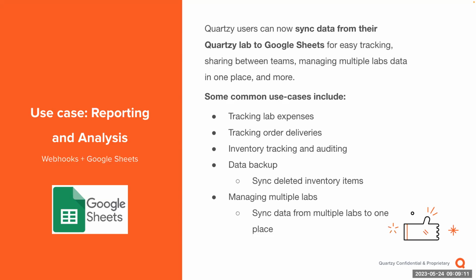So you can sync inventory items as they're deleted. So you always have that nice data backup. That way you can restore those items if needed. And then managing multiple labs. So you can actually send data from multiple different labs to the same place.